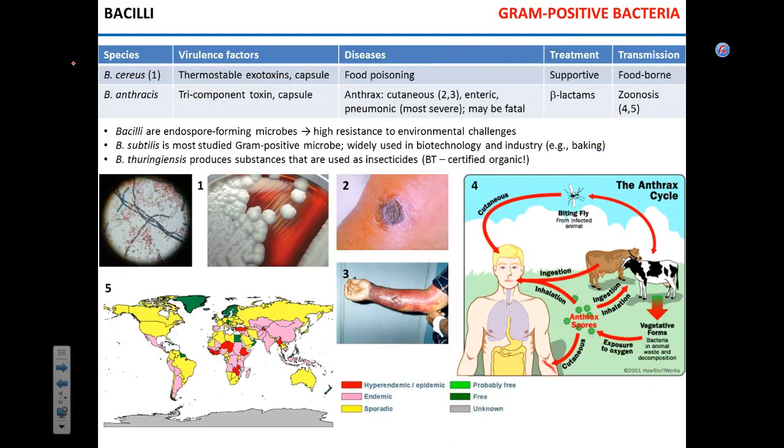There we go. Another pathogen. Bacillus. Really fascinating one. Some of it you hopefully will never encounter. Some of it, unfortunately, you will encounter many times in your life. So we're going to talk about 3 species.